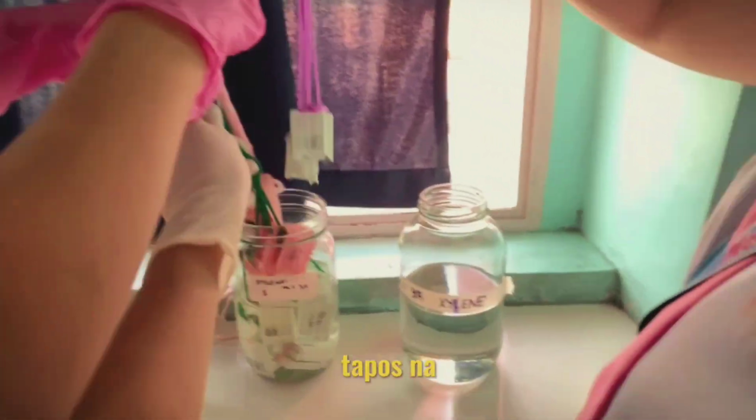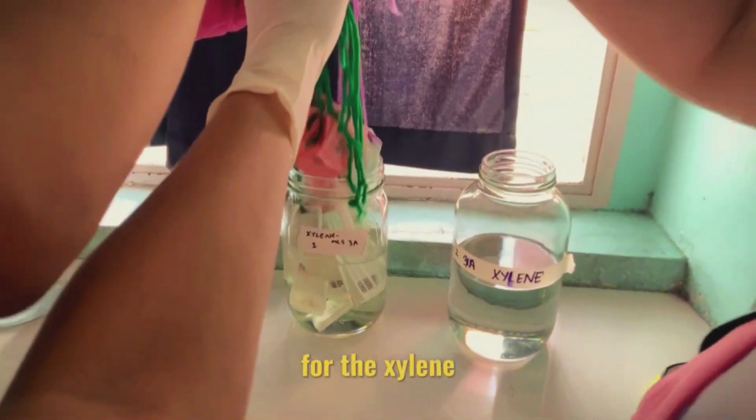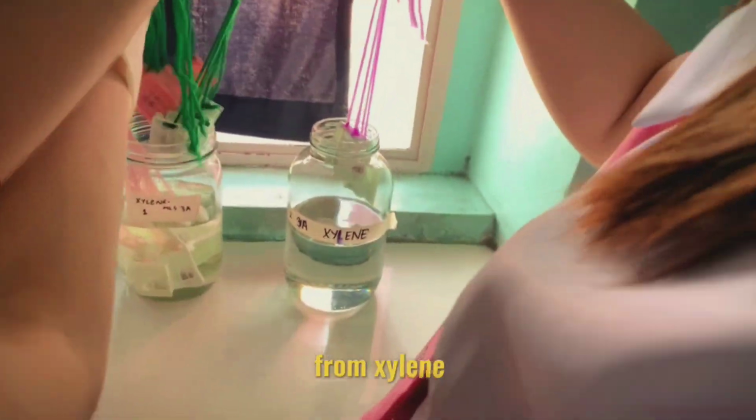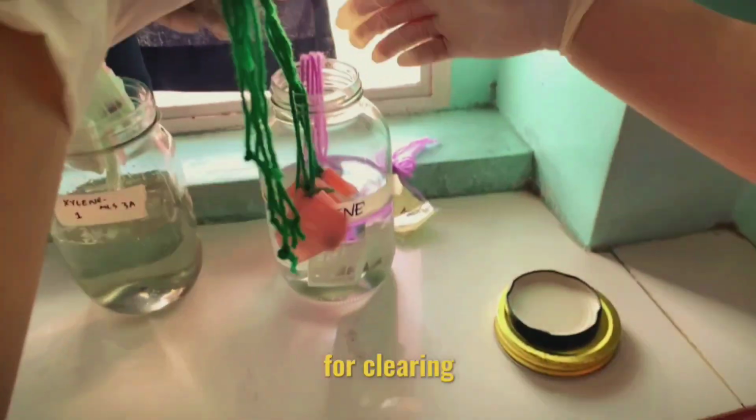We can see that we are done with xylene 1 for clearing. The next step is xylene 2. So this is the xylene 2, together with my group mates. We start to transfer the tissue from xylene 1 to xylene 2 for clearing.